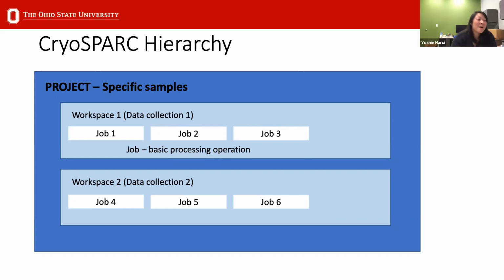It's hidden in there, but we have an HGPU machine that is essentially divided into four GPU lanes. I didn't go over it, because when you submit the jobs, you essentially select a lane in which to do the processing. So you either pick 4 GPUs or 1 GPU, or if it's CPU intensive, you can specify CPUs. So it depends on the job which lane you would pick, if that makes sense.